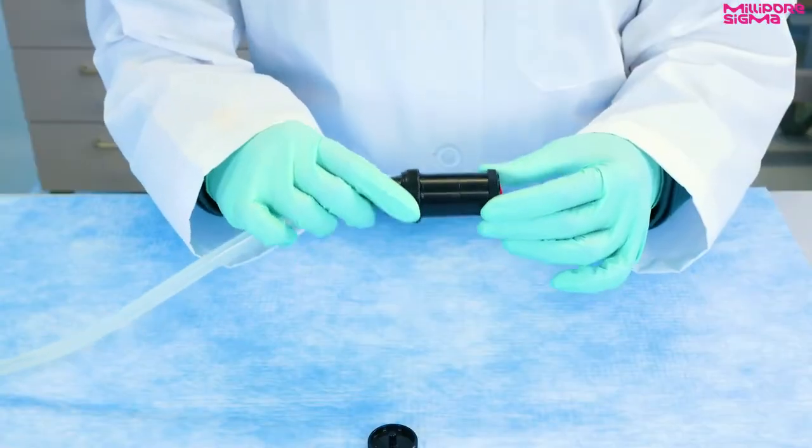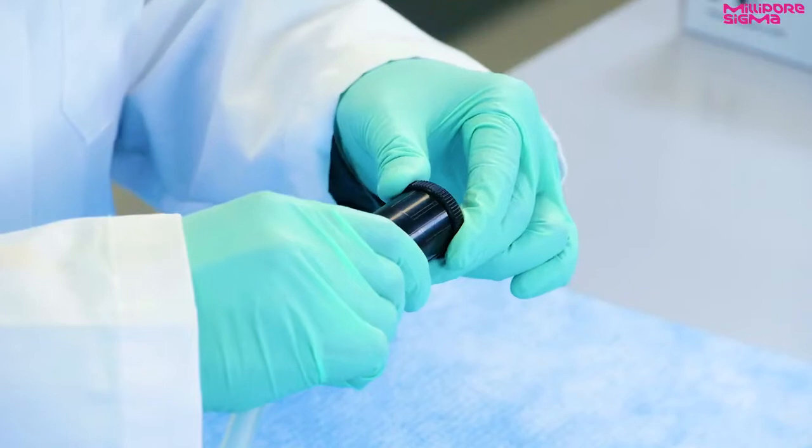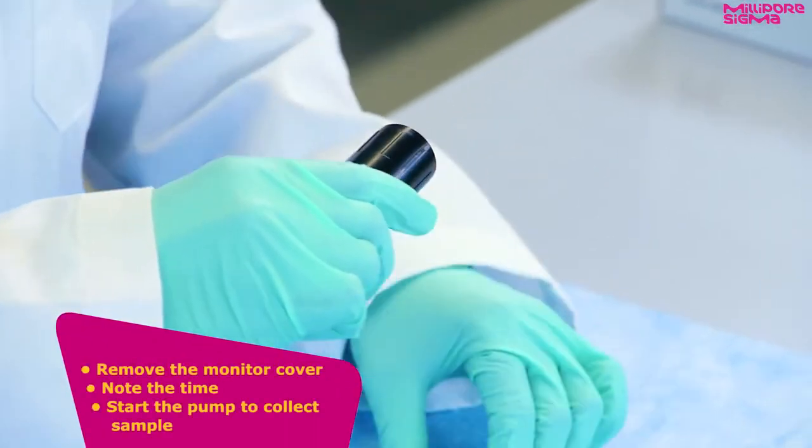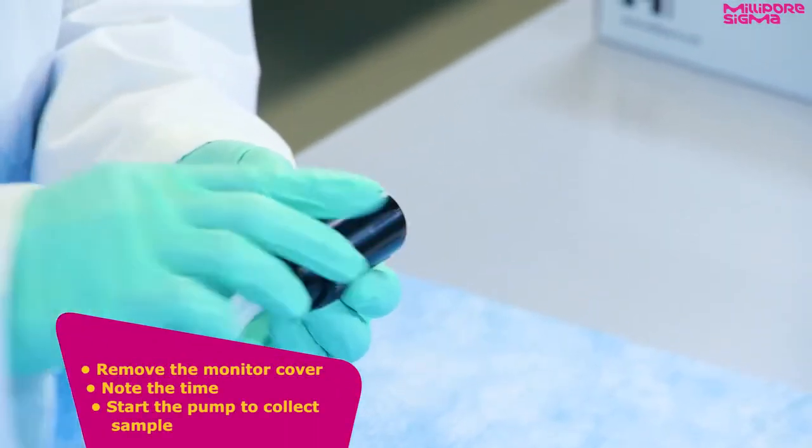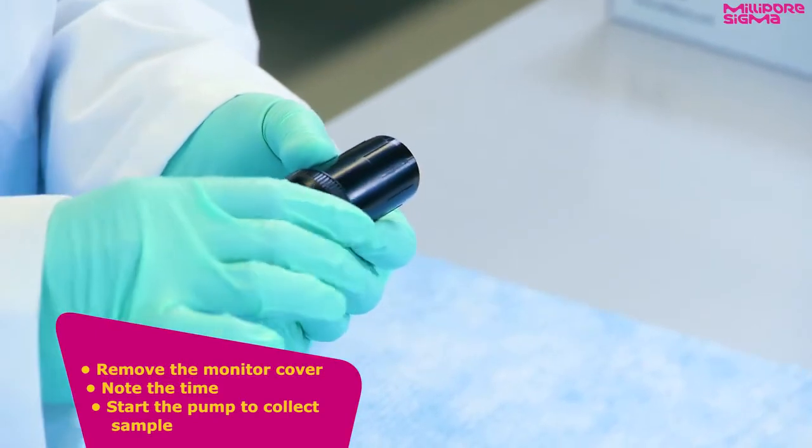To start sampling, position the monitor where the sample is to be collected. Remove the monitor cover, note the time, and start the pump to collect the sample for the specified time required in the method.